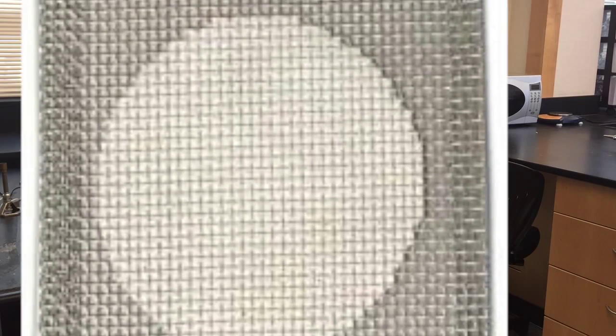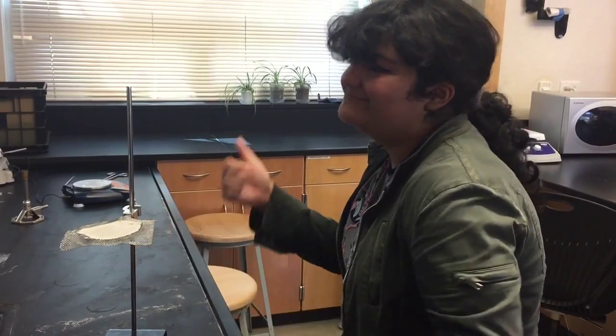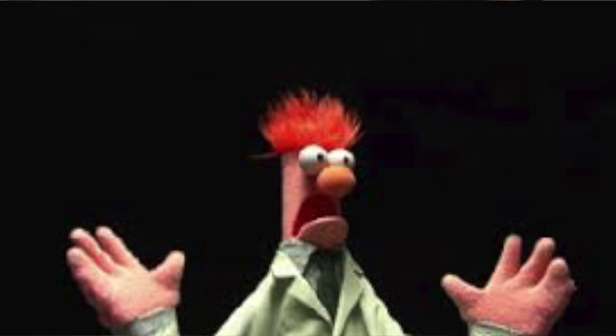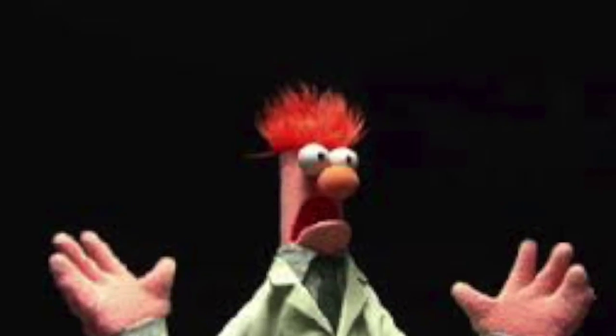This is a wire gauze. Its purpose is to shield any type of heat. As you can see here, the iron ring stand holds the iron ring, the iron ring holds the wire gauze, and the beaker is on top. Usually a Bunsen burner is placed underneath to heat anything inside the beaker.